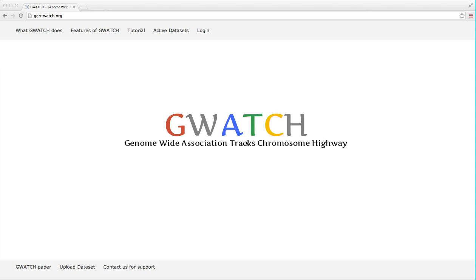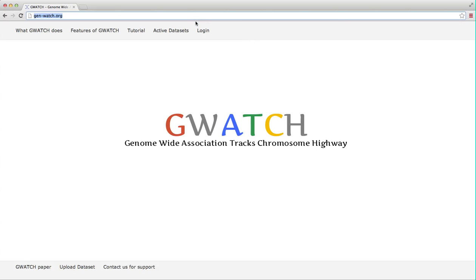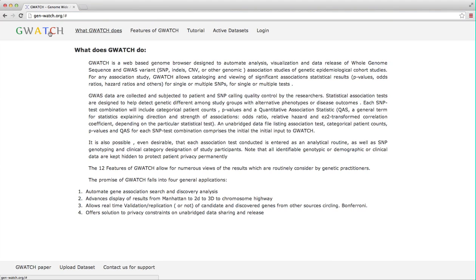GWATCH is available on gene-watch.org. The front page contains several starting links. They are what GWATCH does, a brief narrative text that highlights the applications of GWATCH that we can imagine. Toward the bottom of the page, there is a list of the four main applications of GWATCH.